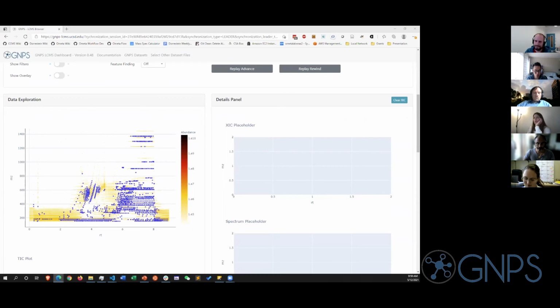If you have an older Internet Explorer, which is not particularly supported right now, this is a very heavy web application, so they don't seem to handle it very well. What you might be seeing is a big frowny face on either the whole website or on certain parts of the interface.